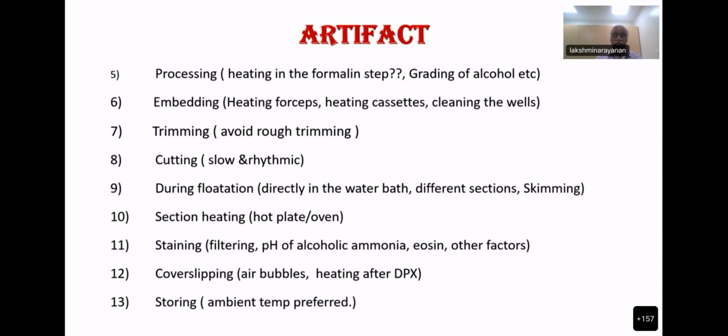Then section heating, that also Dr. Praveen has mentioned. Hot plate if you are heating, or in the oven you are heating after sections are taken on a slide, it should never cross 60, 65. But I have seen personally that many people heat it beyond 70 or sometimes 100. It reaches 100. Nobody checks the oven also, because only an NABL accredited or some big hospitals will follow these things. The oven, they will heat it for 5 or they will heat for 20 minutes and then take for stain.